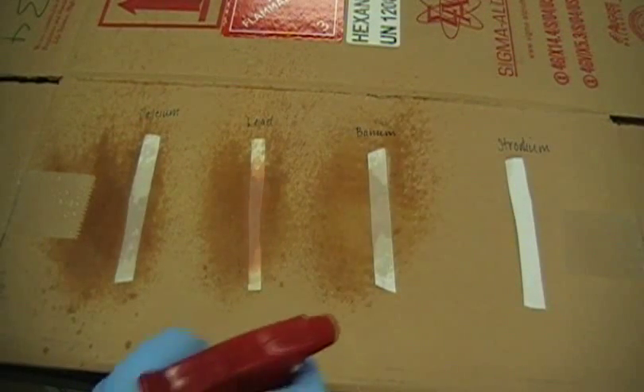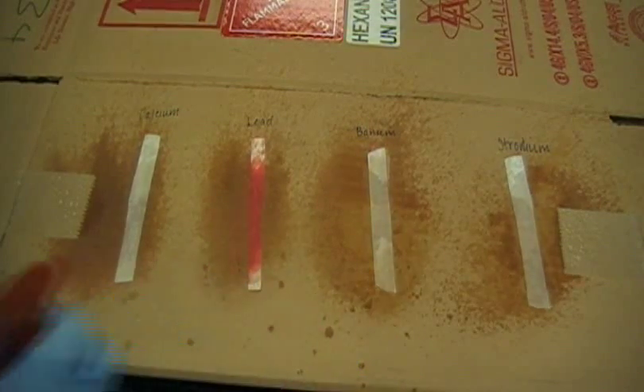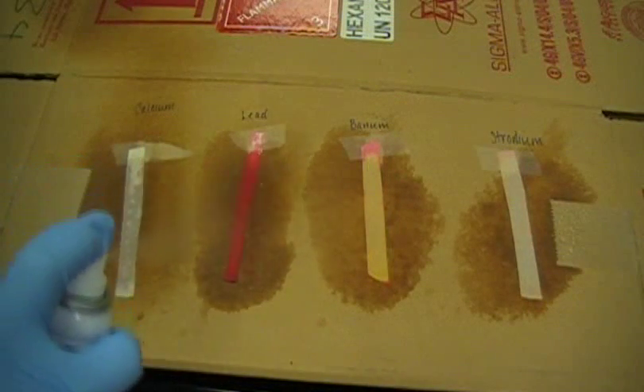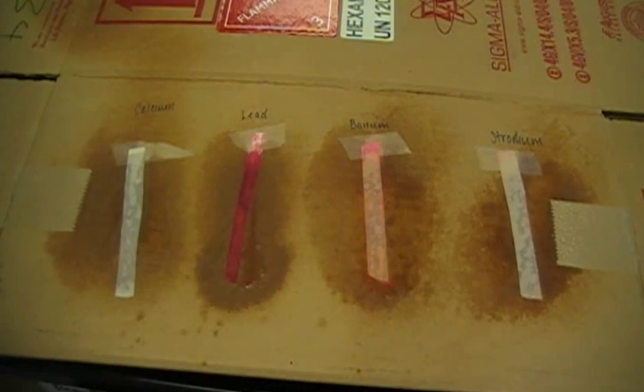To begin the lead test, sodium rhodizinate is sprayed on four known samples: calcium, lead, barium, and strontium. The presence of a pink color indicates any of these metal ions are present. To confirm the presence of lead, concentrated HCl is sprayed on the samples. A purple color indicates the presence of lead.